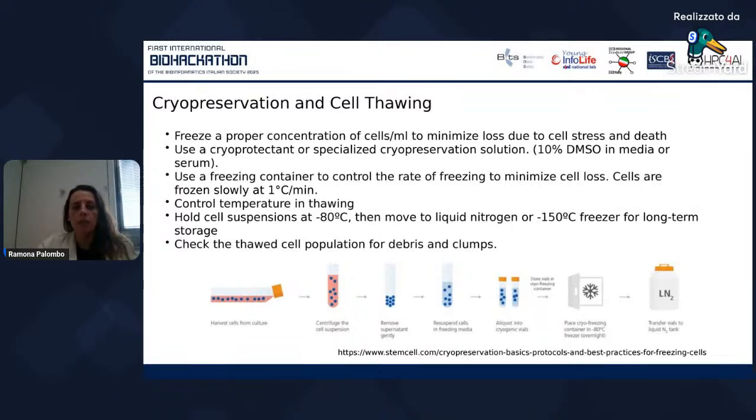For freezing and thawing conditions, there are several hints and several specifications. So, for example, the concentration of cells to minimize the viability loss, also the temperature and the timing of storage could be very important.